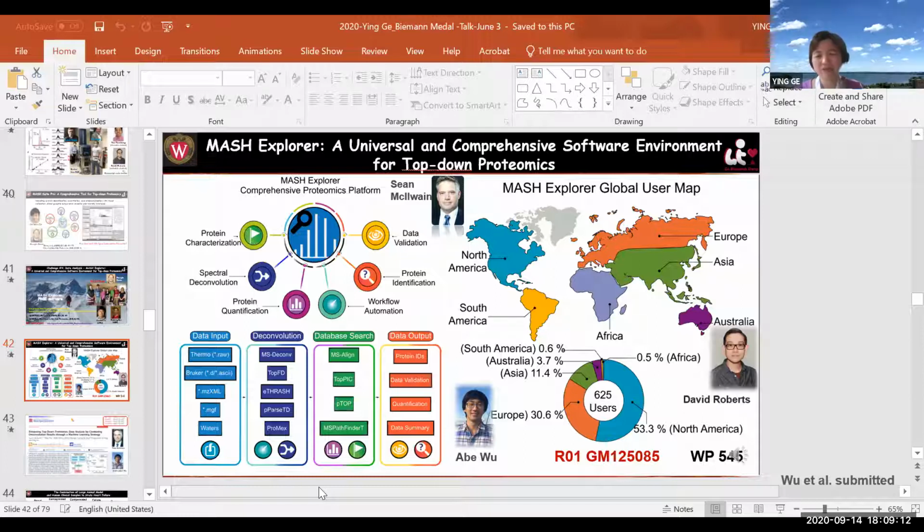Right, that's a great question. We actually cannot incorporate those, because software like MaxQuant or others that they sell for a price, they will not give us the algorithm for free. Remember that our software is free. So we do not have the Byonic algorithm, but we have Thrash, of course. But I think ProMex is getting better, and UniDec really is made for good deconvolution. So there's a lot of free, open access, open source software.